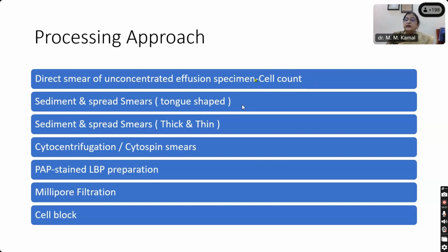It is not sedimented as yet. So many institutes prefer using this type of fresh mounted specimen with toluidine blue stain. It gives you a lot of information. The departments that do this type of processing are very much convinced that it gives them a lot of guidelines regarding the nature of the cells, distribution of the cells, whether they are dissociated or in clusters or in cell balls, etc. So it is a practice which depends from department to department.